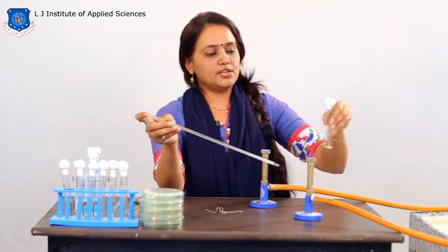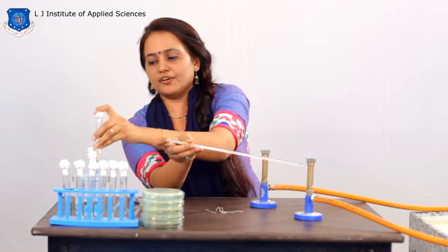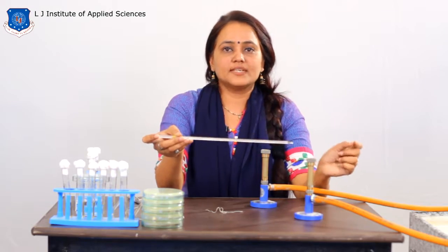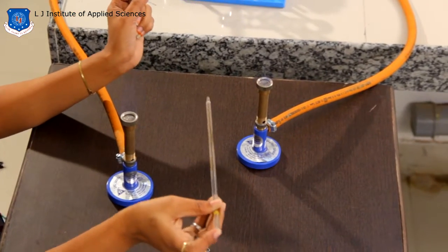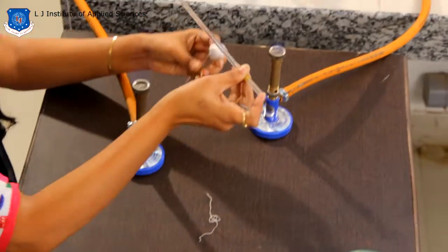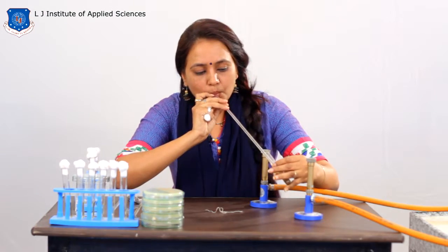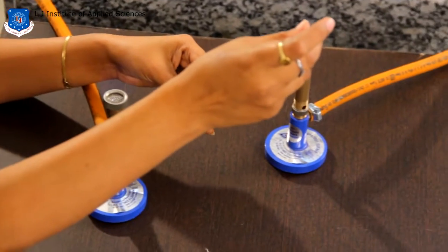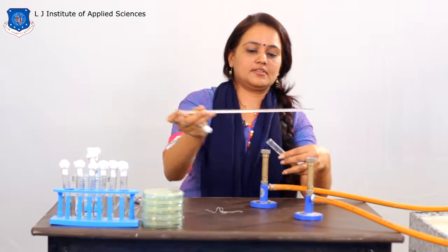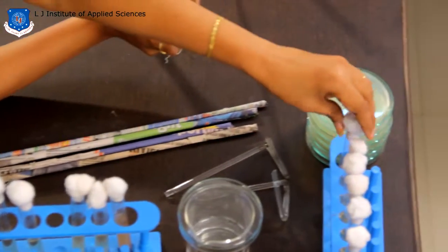And as we are using nutrient broth, nutrient broth is a generalized medium for growth of aerobic organisms, as it contains 1% peptone, 0.5% NaCl and 0.3% yeast extract. Now the same soil suspension I am going to add into different pH to check the pH range of the organisms which are surviving in soil.